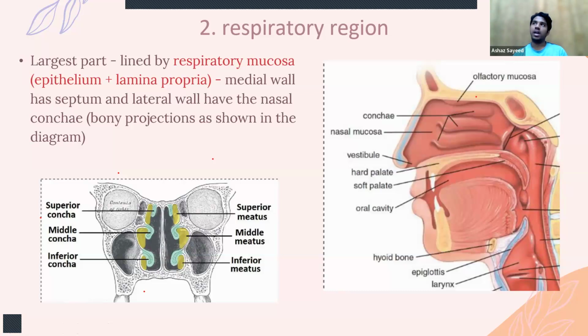Okay, did we have a lamina propria so far? I don't think we had something called a lamina propria so far. Okay, so the lamina propria, this thing, on top of this, you're going to have the epithelium. So it's epithelium, basement membrane, and then the lamina propria. Okay. This is the largest part, as I told you before.